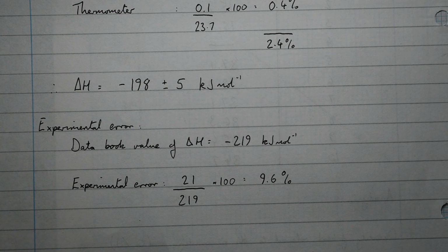So that experiment then shows you how to carry out a calorimetry experiment and how to analyse the results of that experiment. In a separate video, I'm going to show you how you can carry out a calorimetry experiment for a combustion reaction, which obviously can't take place in a polystyrene cup.